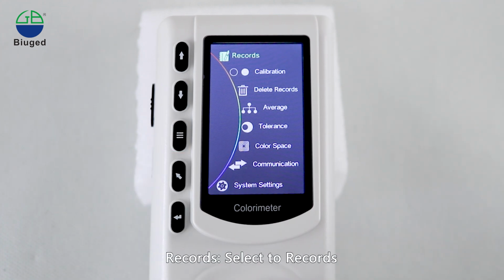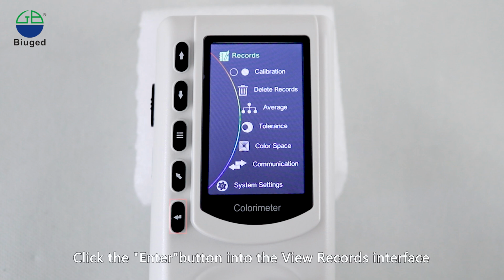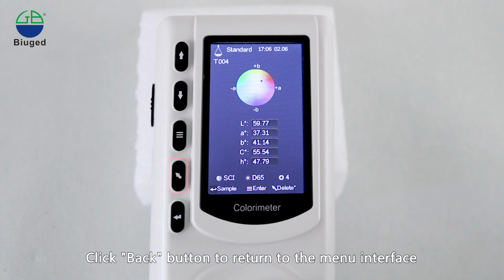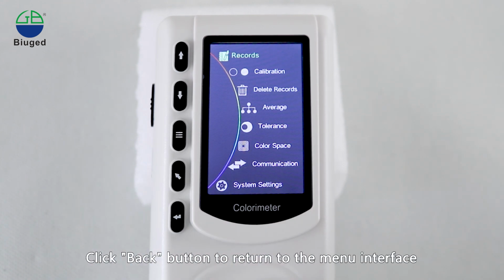Records, select Records. Click the Enter button to go into the View Records interface. You can view historical records through the up and down buttons. Click the Back button to return to the menu interface.